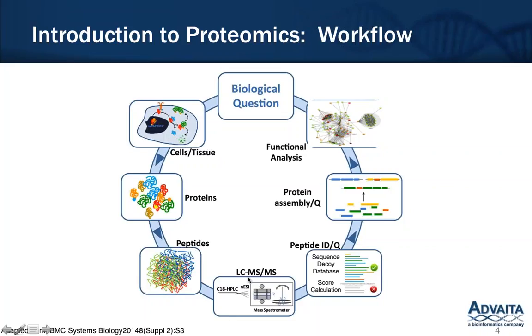And what happens in the mass spec machine is that the mass to charge ratio of a protein and the fragmentation spectra is recorded. This mass spec data, which includes peptides, is then aligned to a sequence database, after which it is assembled into proteins and quantified, and a differential expression file is produced if you are comparing two different sample types. And then from this differential expression file, you can do further functional analysis, such as pathway analysis, gene ontology term analysis, in bioinformatic applications such as iPathway Guide, and that's what I'll show you today.